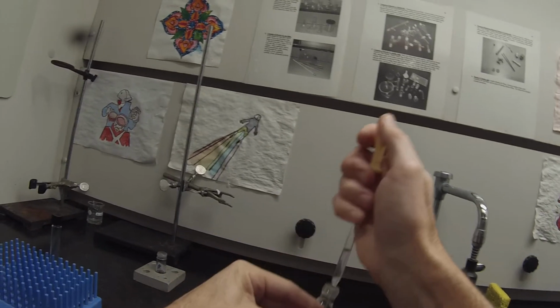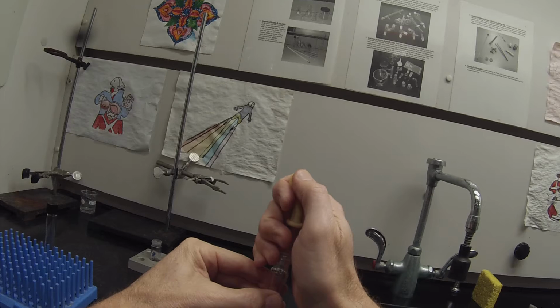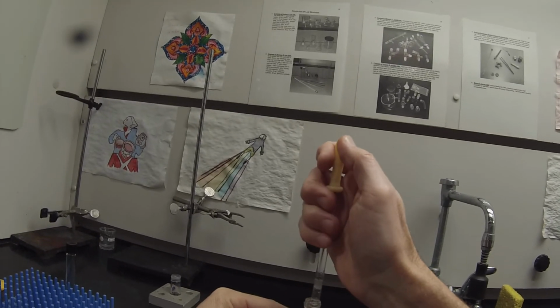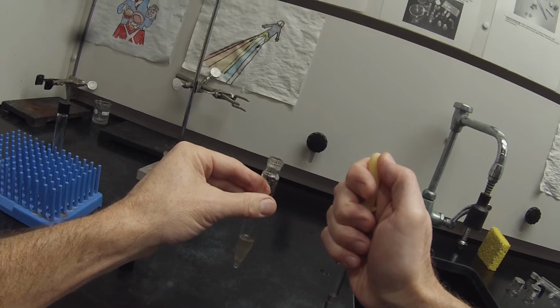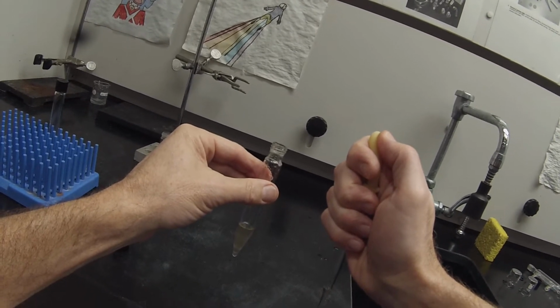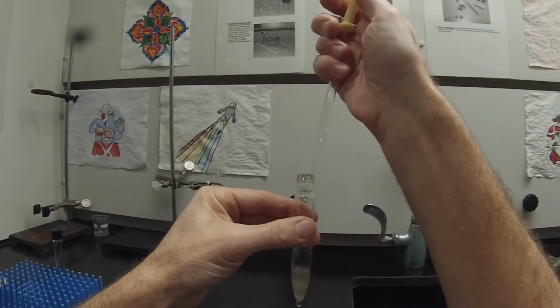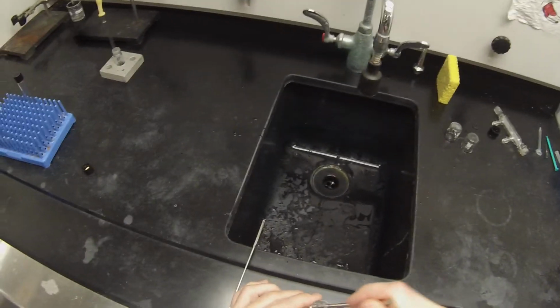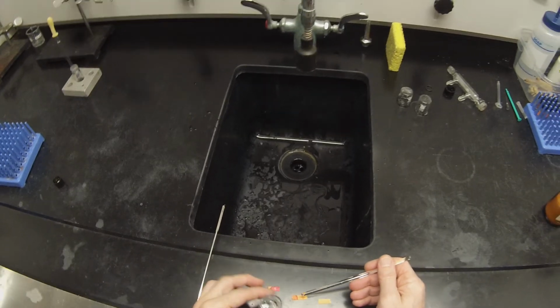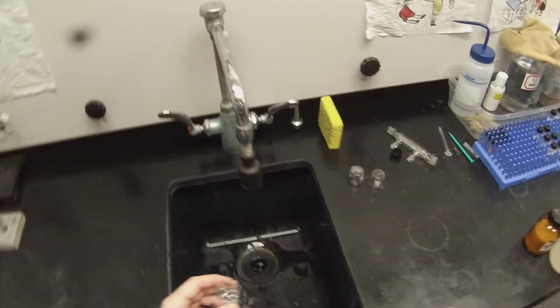We're taking that bottom layer out again. And just let it settle. Squirt the bottom layer into the beaker, and then that residual top layer that's in the pipette can be returned to the centrifuge tube. And then we'll see if this is still acidic. Yeah, it's not too acidic. It's not basic either. So I think I am going to do a fourth wash.